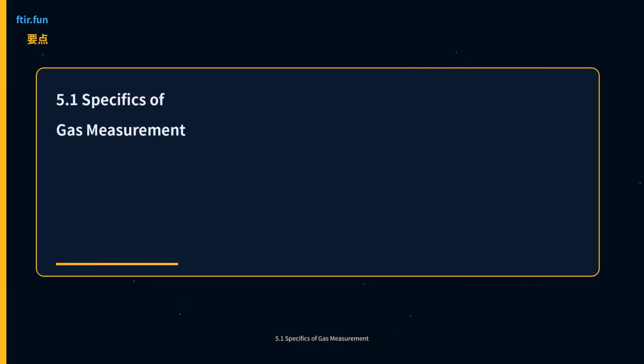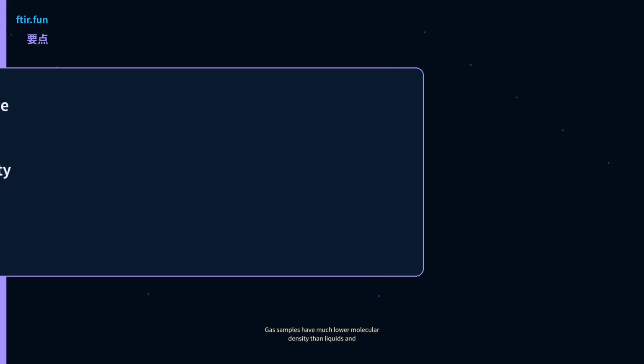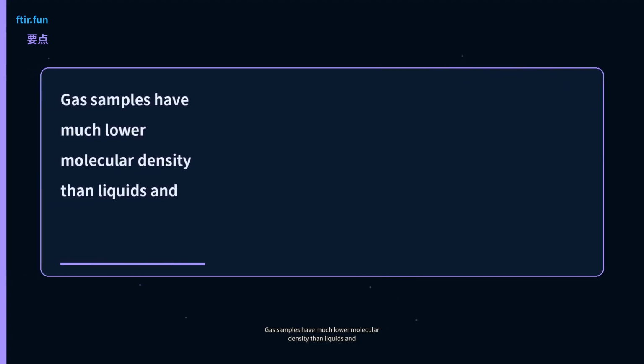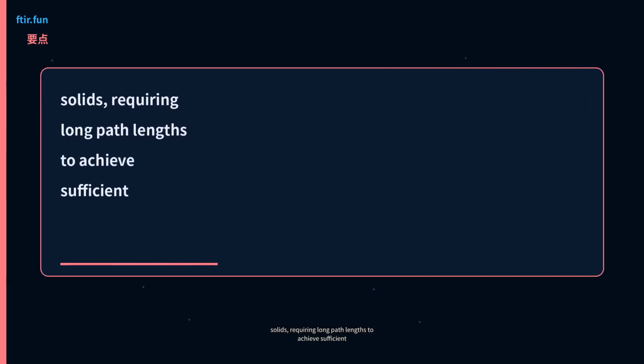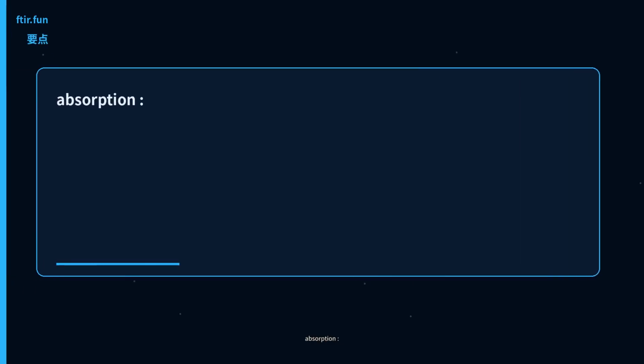Next, the gas cell, a dedicated tool for gas samples. 5.1 Specifics of gas measurement. Gas samples have much lower molecular density than liquids and solids, requiring long path lengths to achieve sufficient absorption.